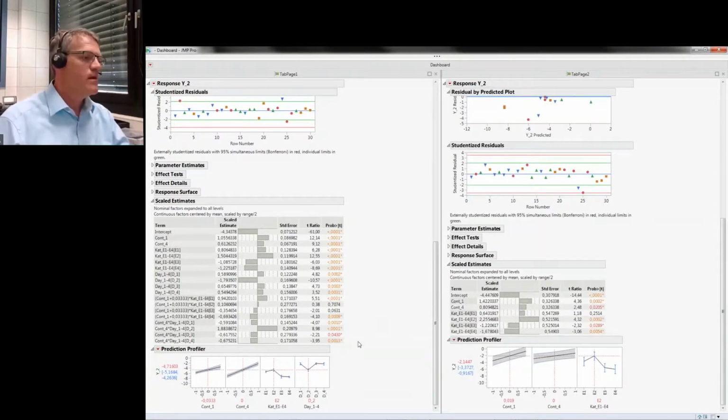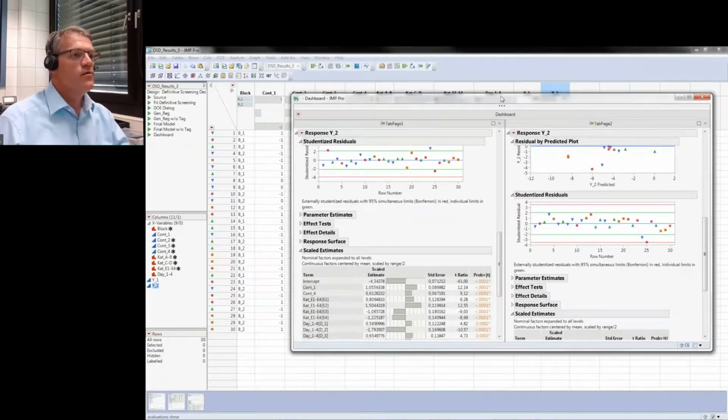In our case, as this effect is not the one an experimenter wants, because on every day the results should be comparable and not such a big difference, we had the possibility, after digging into the data, to find an effect which then led to these degrees of yield in these specific experiments during day 2, and then we could identify the root cause and skip or modify our further processes.